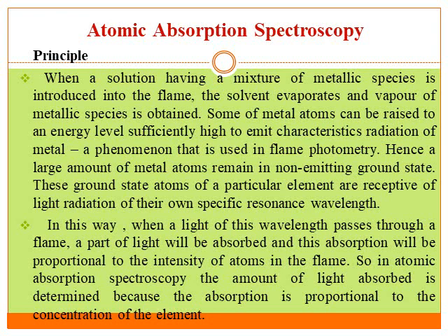From this we can easily calculate the concentration of the element or metal. This absorption intensity is proportional to the concentration of the element. So absorption intensity is calculated for atoms present in the ground state which are not capable of being excited.